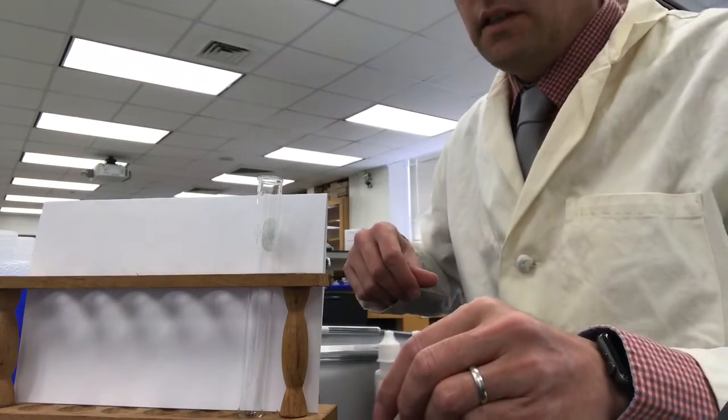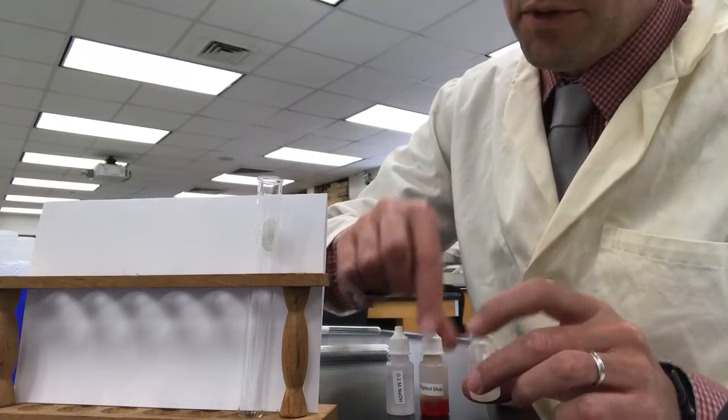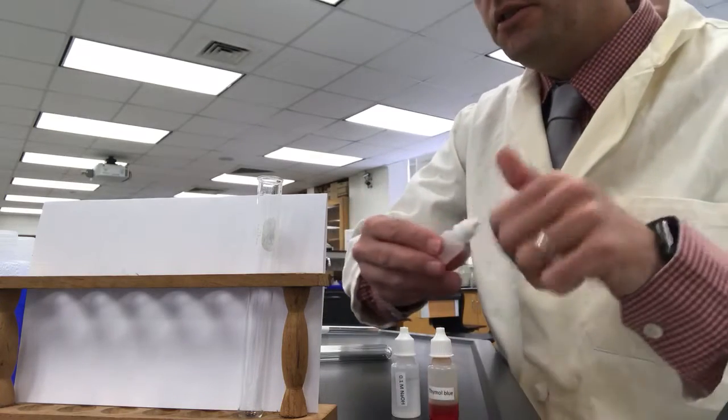I don't think this is on the data sheet, but this is a bonus for you if you've been assigned thymol blue. We're going to add 10 drops of water, one drop of thymol blue, and one drop of sodium hydroxide.